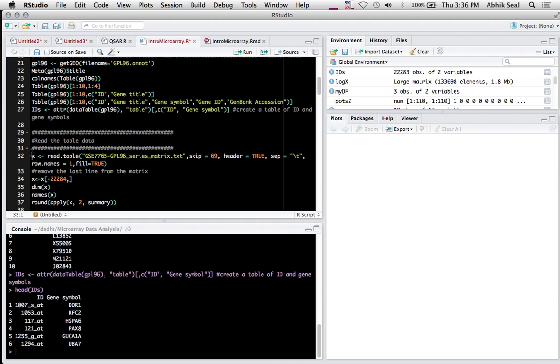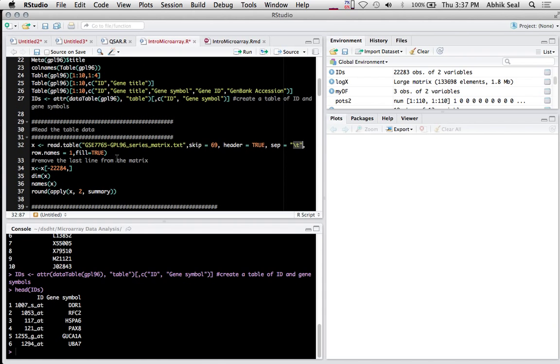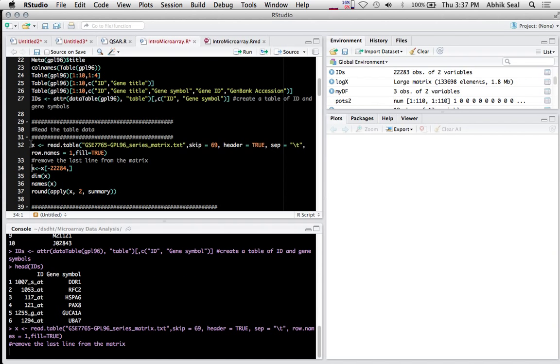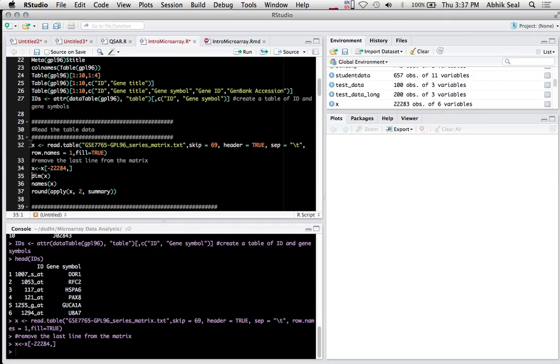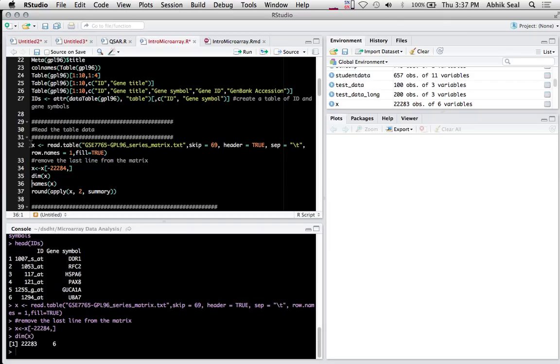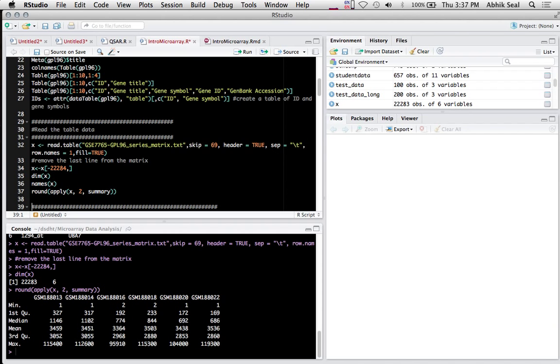Then I load the main expression matrix. I skip 69 lines because that contains a long description of the platform. I use tab-separated format and there's also a header. At the 70th line you'll find the header of the matrix and the row names. Once loaded, you can see there are 228 genes and 6 samples of control and dioxin-treated.